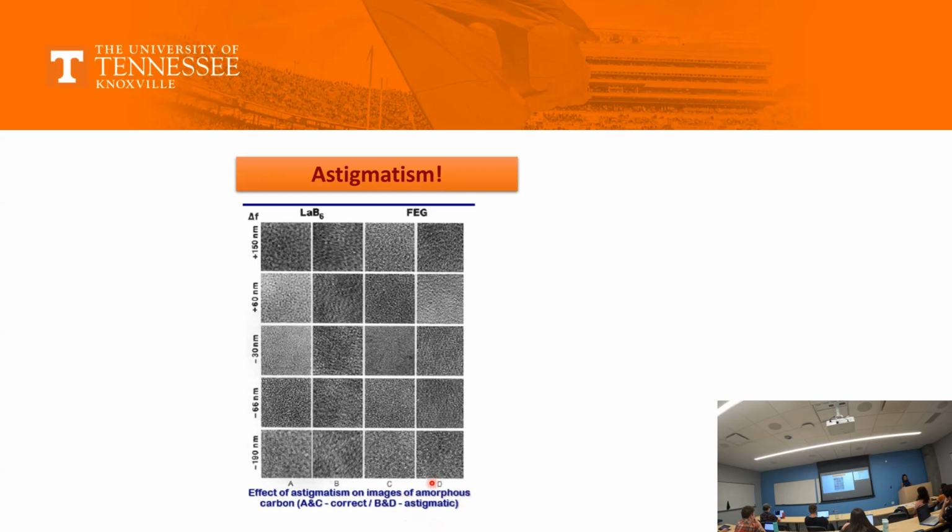The best amorphous zone that you would find in your material would be the platinum deposited by FIB. This is an important note. When you prepare a sample, as I told you in the beginning, you deposit a platinum on top of it, or a carbon with a marker. You go there, you select that zone, and you should be able to see a sharp image like this.